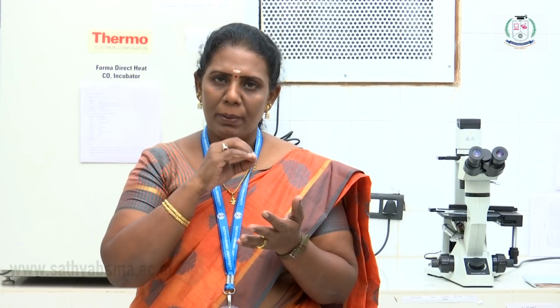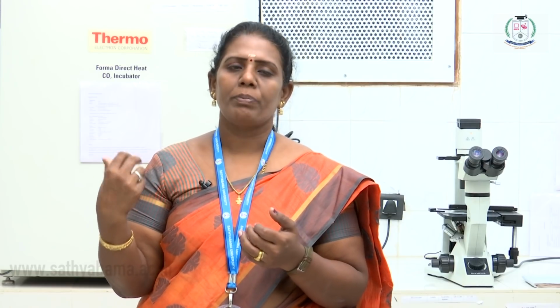This growth has to be perfectly maintained by the addition of the required amount of media and sera, which gives strength to the cells, and they will start to divide. So the division can be performed inside the CO2 incubator. We will discuss later all these techniques and the mechanism of action and everything. So this is the incubator where the cells are simply sitting and they will start dividing.